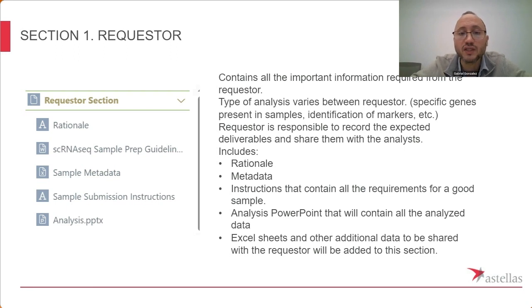Identification of markers, all that we want to be captured at least in the requester section. So the requester will be able to put all their needs and wants into this section, and then us, the analysts, will be able to view that and use that information for the data analysis in particular. Because the library prep and all the other steps should be the same, it's mainly for the data analysis part of this experiment.